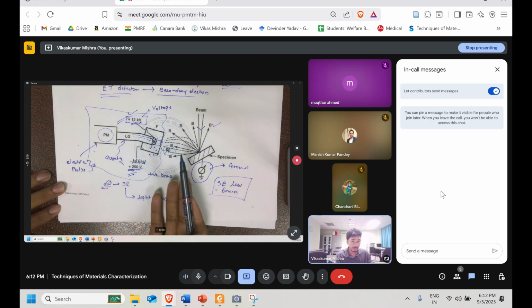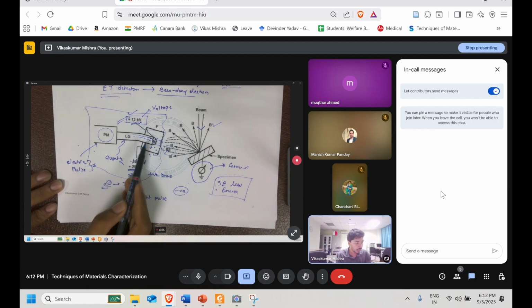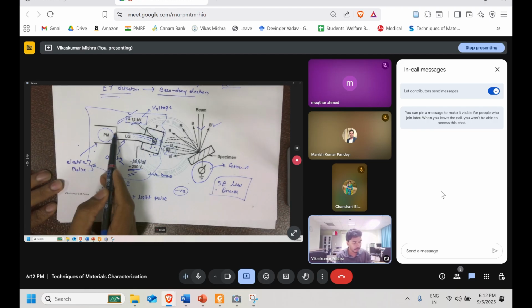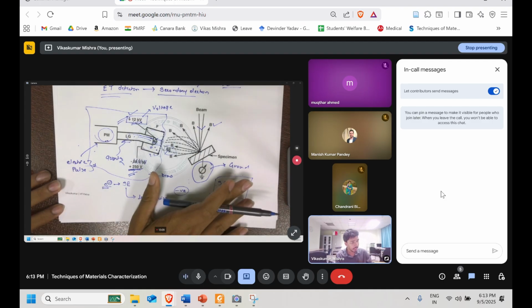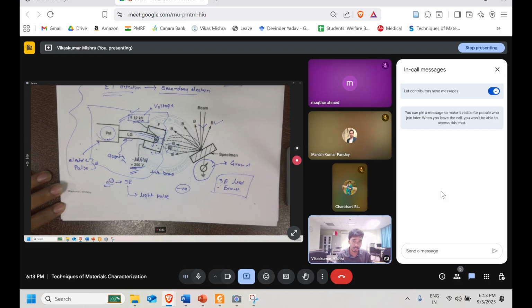Now after that the fluorescence phenomenon happens. The light will be emitted once the electron is excited to the higher energy state, and then that light which is emitted will transfer through this particular light guide to a photomultiplier, which will convert the light signal to the electric pulse signal, right? So this is the entire behavior, the way we are detecting the SE signal.